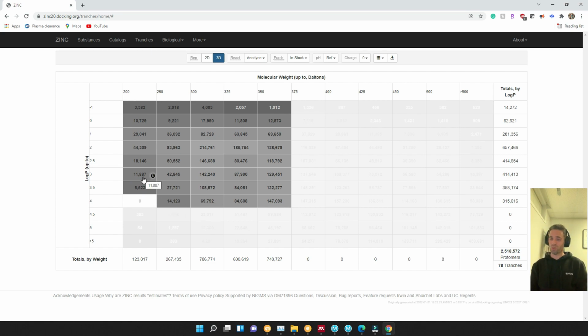I kind of want to run, yeah, let's do 2.5 million compounds. That's a reasonable drug screen. I am slightly curious to see if any very small molecules will bind to the CB2 receptor at the orthosteric binding site.